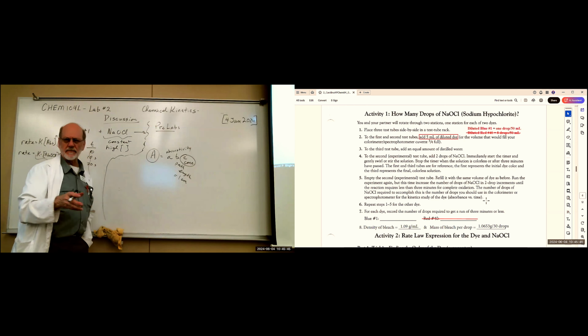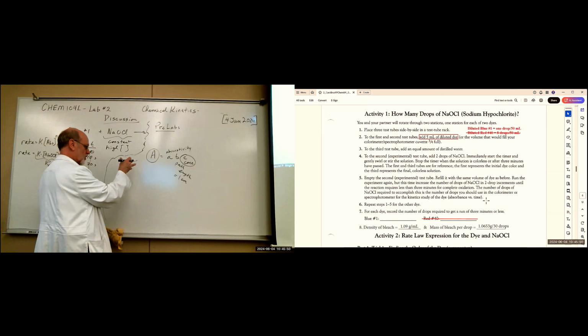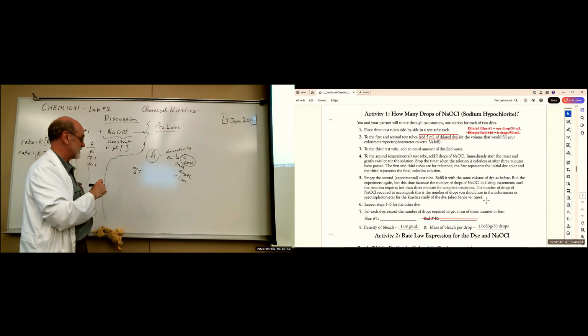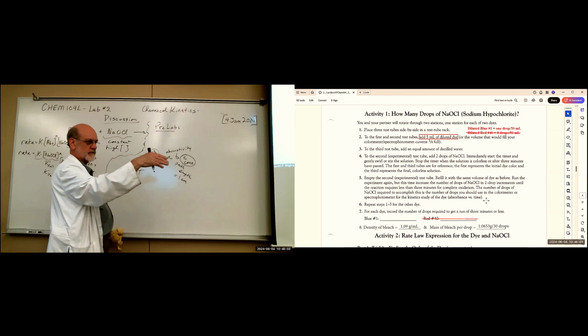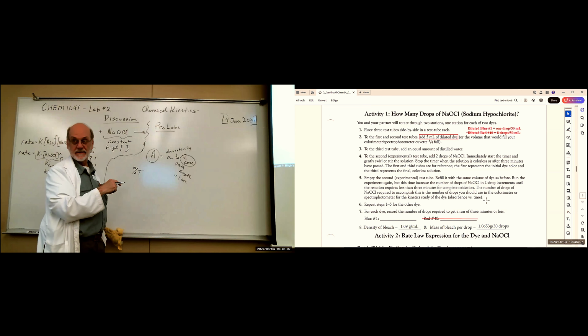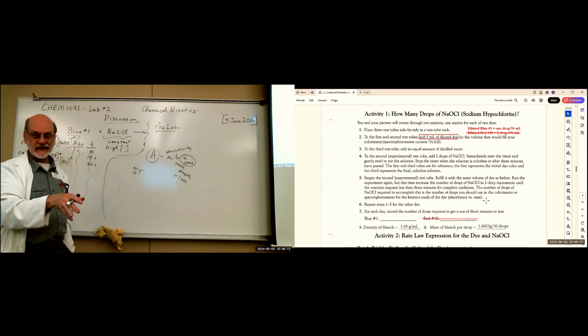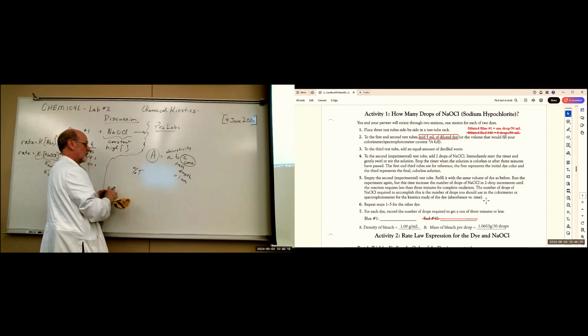Now you'll see on spectrophotometers, you have 2 ways of reading them. You've got absorbance units and you've got percent transmission. They're not exactly opposite one another. Percent transmission is an arithmetic progression, like 1, 2, 3, 4, 5. Absorbance is a log function, and the log function is the one that's linear. Percent transmission is not linear. That's why we use absorbance.